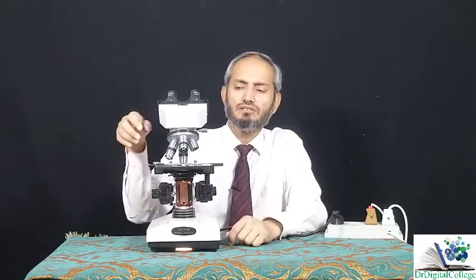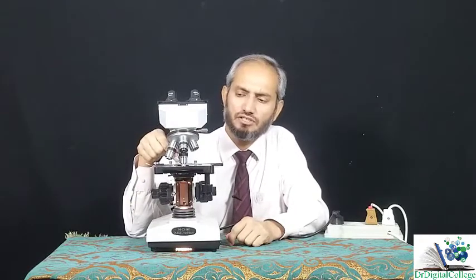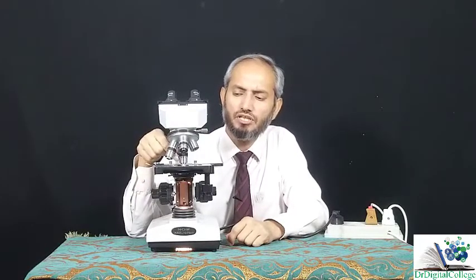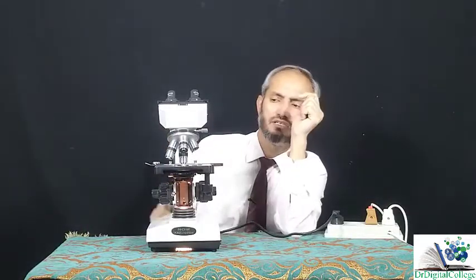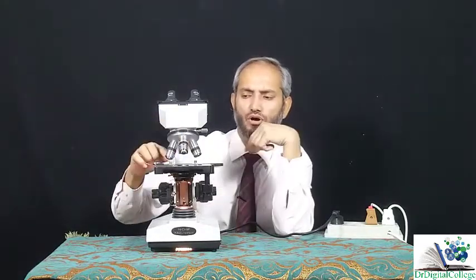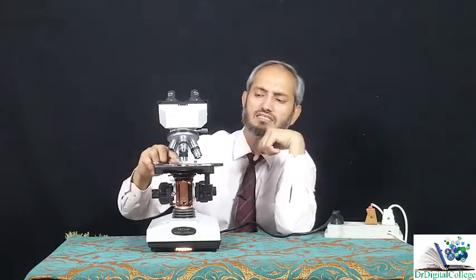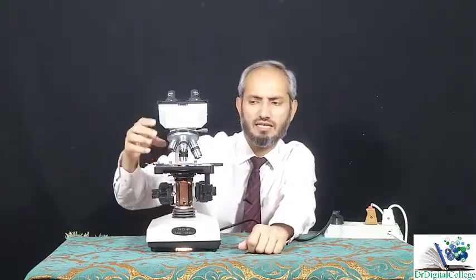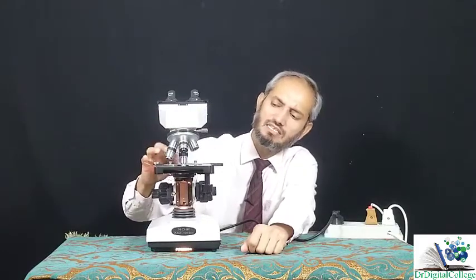But you know that when you are using the objective lens of high magnification, here 40x, you can see the objective lens is just touching your slide. If you are using 4x, there is a big distance between your object and the lens. If you are using 10x, the distance has decreased between the object and the end of your objective lens. And if you are using 40x, the distance is minimum.